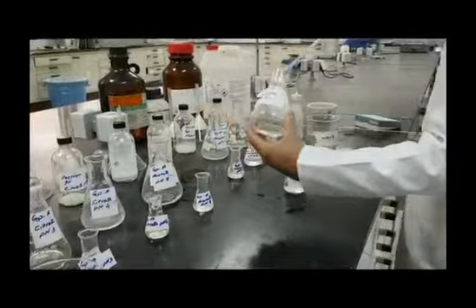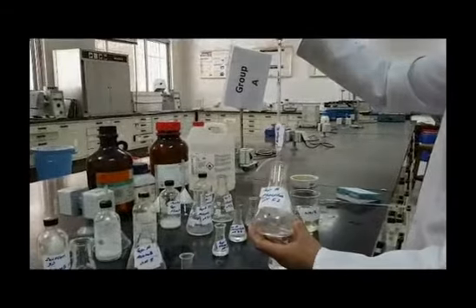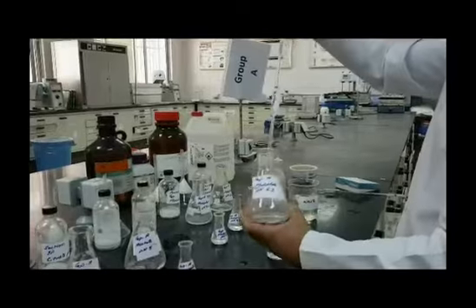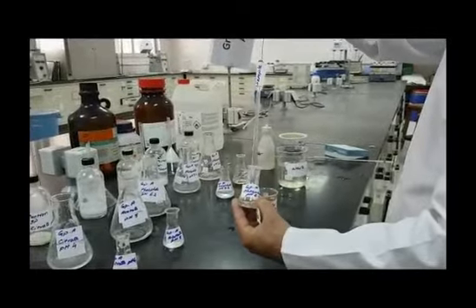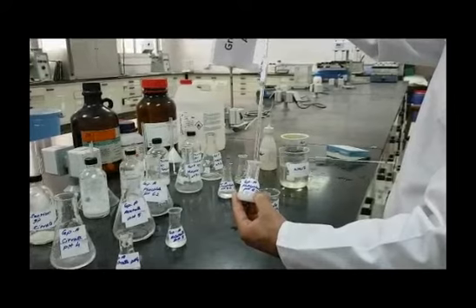By performing this step and diluting our samples by 2-fold, we are converting half of our sample to the same solvent, which means we can use the sodium hydroxide as our blank.